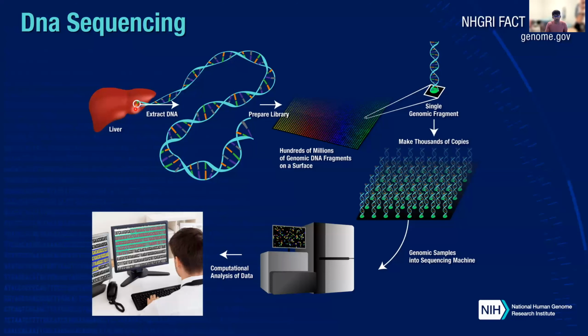Then they apply various chemicals to make this untangled, because it is stored at a very small, maybe micrometer scale, so you need to make it untangled.